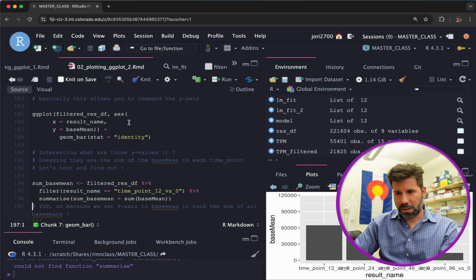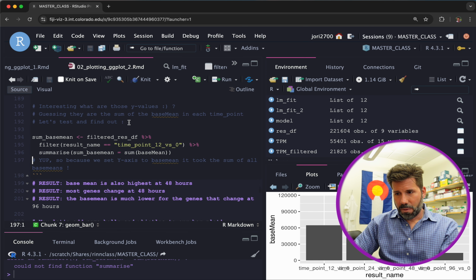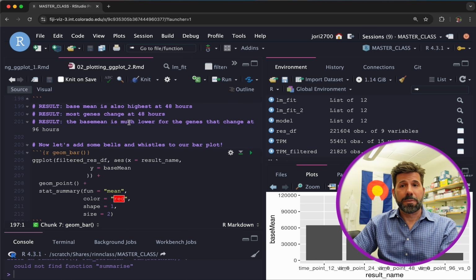I don't have the package loaded. Okay, so that we can just ignore for now.